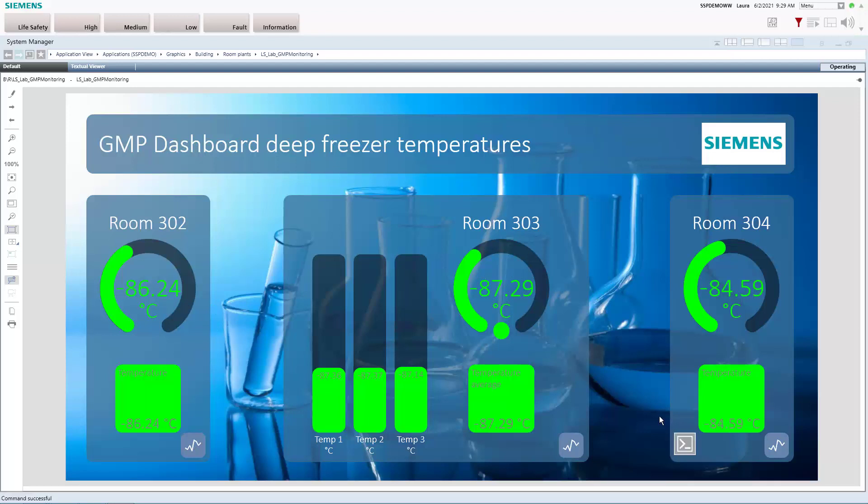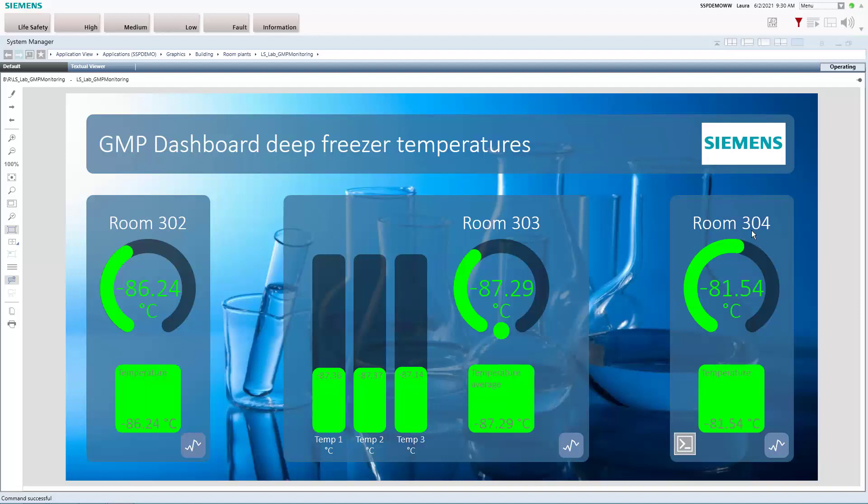But now looking at this dashboard we also recognize that the temperature here in room 304 is starting to increase. So first of all this is not so unusual because the doors of these deep freezers are being opened here and there. But now we see that in this case it doesn't really stop.